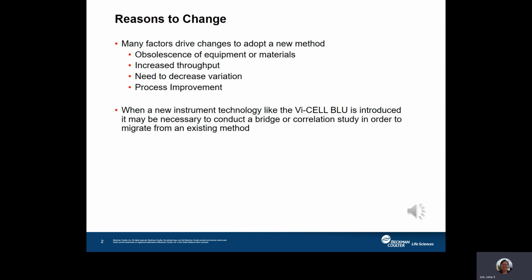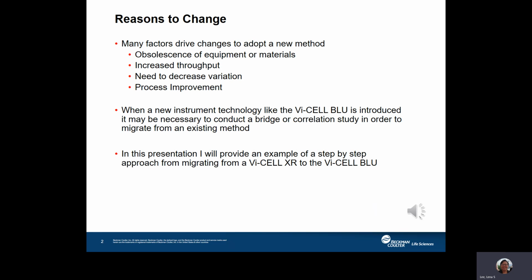So when customers are transferring their current method to the ViCell Blue, they may need to perform bridge studies or correlation studies in order to migrate their existing method to the new instrument. In this presentation, I will provide an example of a step-by-step approach on migrating a ViCell XR to the ViCell Blue.